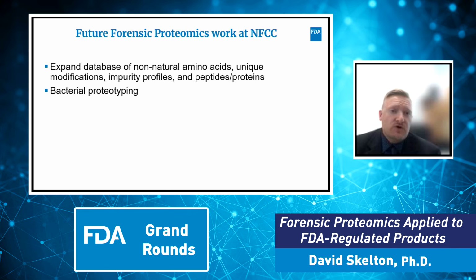So as far as the future work that we do here at the NFCC for the proteomics, we are always looking to expand our database of any non-natural amino acids, known modifications for our peptides and proteins, and also doing impurity profiling and generating impurity profiles for all of the observed peptides and proteins for these samples that we get in, to be able to provide that information to our special agents to allow them to source these counterfeits.